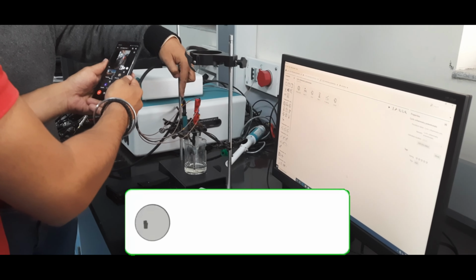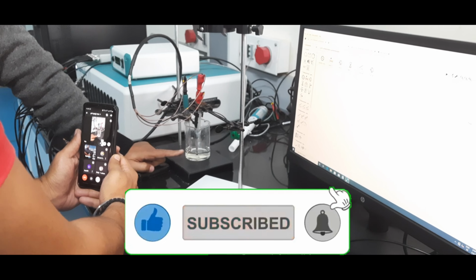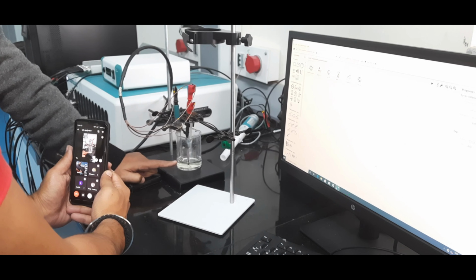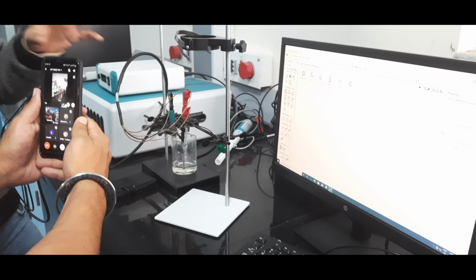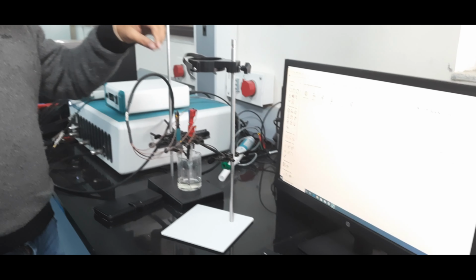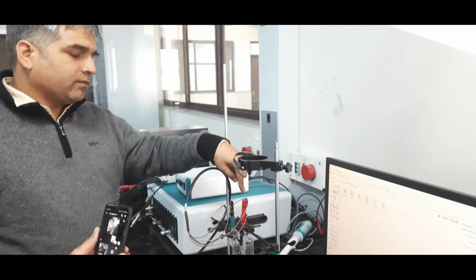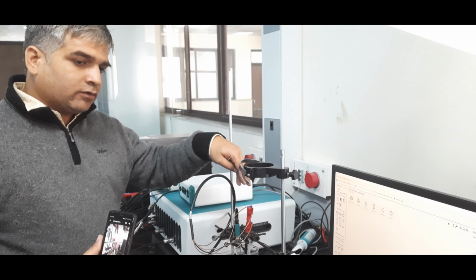A counter electrode, and this solution is ferri-ferro solution in 1 molar NaOH. Okay, so this setup is a 3 electrode setup. So here what we are doing, we are changing the potential of a working electrode with respect to reference electrode. This is a 3 electrode system.